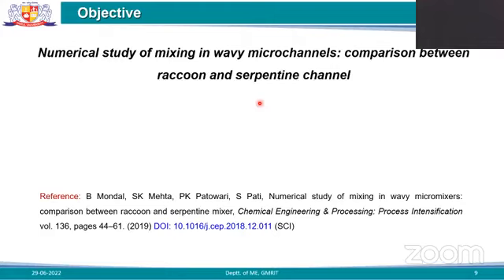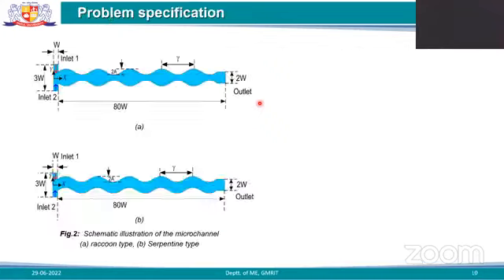And finally, in addition to that, I will also show how this microchannel physically looks. We have also fabricated this kind of channel, and we have also carried out a little bit of experimentation. So I will show it at the end of the PPT.